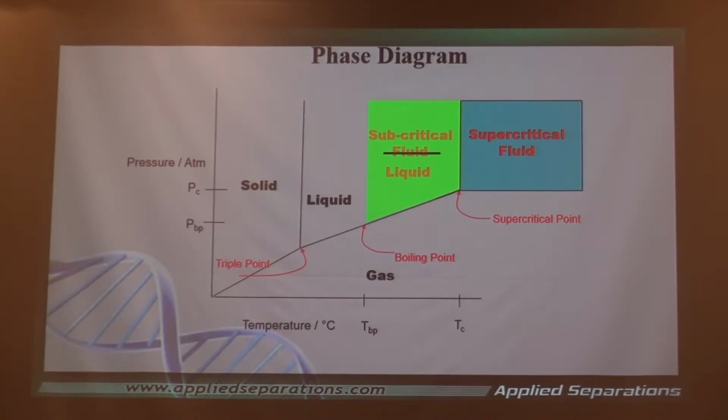For example, as you increase the temperature of the subcritical water, its dielectric decreases, so it becomes more and more non-polar. And this gives you some interesting ideas in a halal setting, for example. Now you can do extractions in water that are very similar to doing extractions with ethanol. Again, something for you to think about. And the equipment that uses the supercritical carbon dioxide can also be used to do subcritical water work as well. Not supercritical, but subcritical.